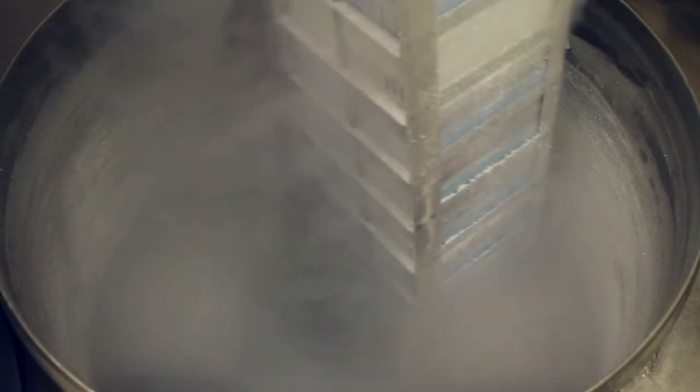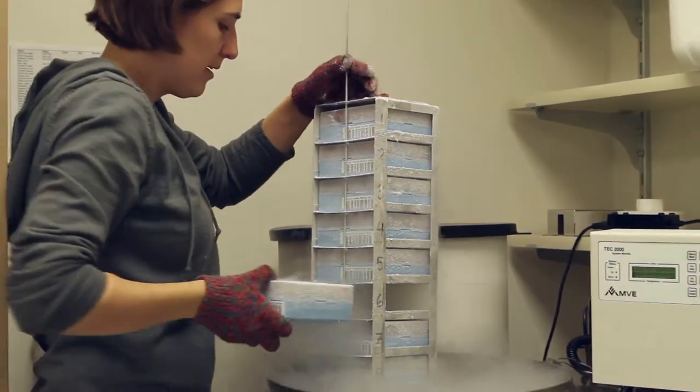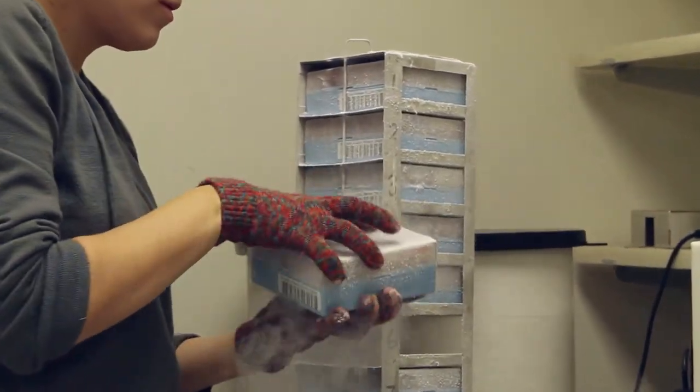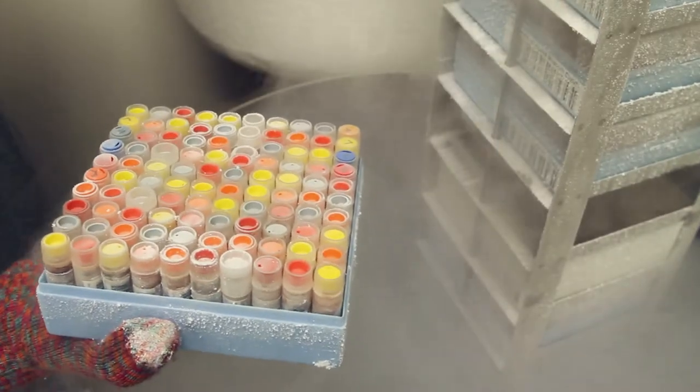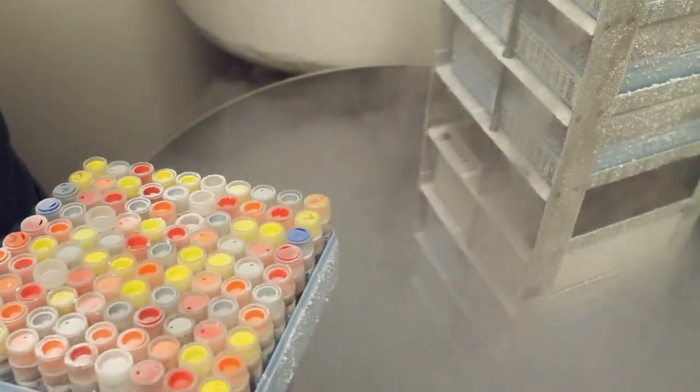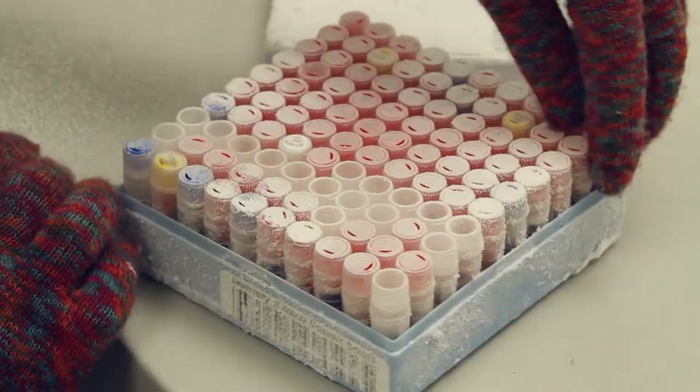When cells die, they automatically start to break down. There's enzymes that start to shear the DNA, break down the tissue walls, and just destroy the entire cell. The idea of deep freezing is that we can actually stop the enzymes from breaking down the cell.